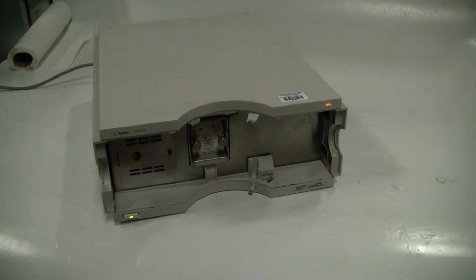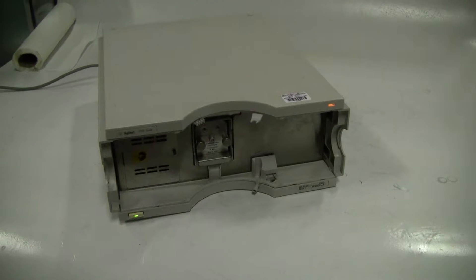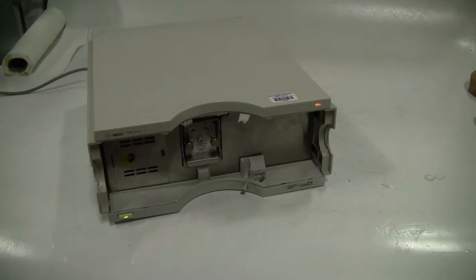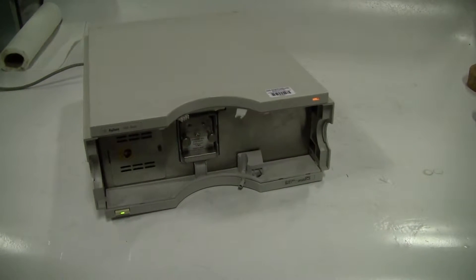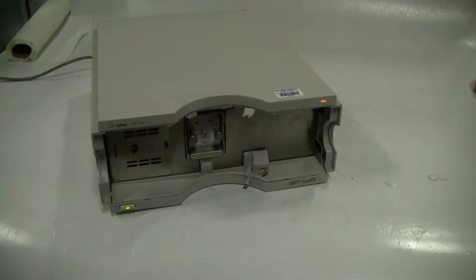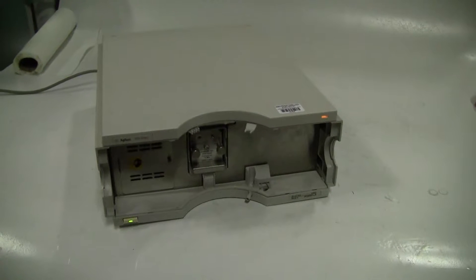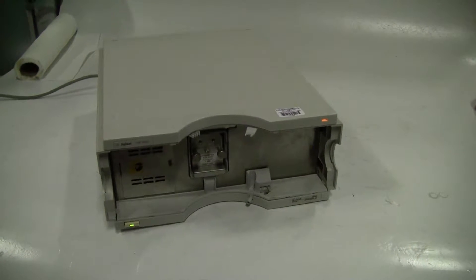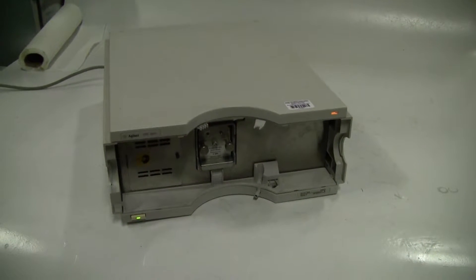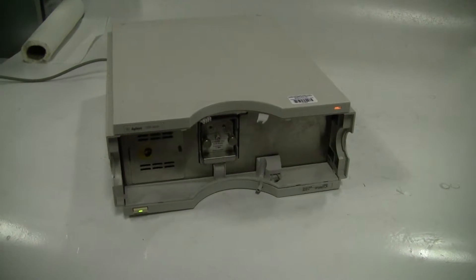However, in our other videos you can certainly see how we hook it up and use LabAdvisor or ChemStation, for example, to run chromatography data before it shipped out in our standard tier.